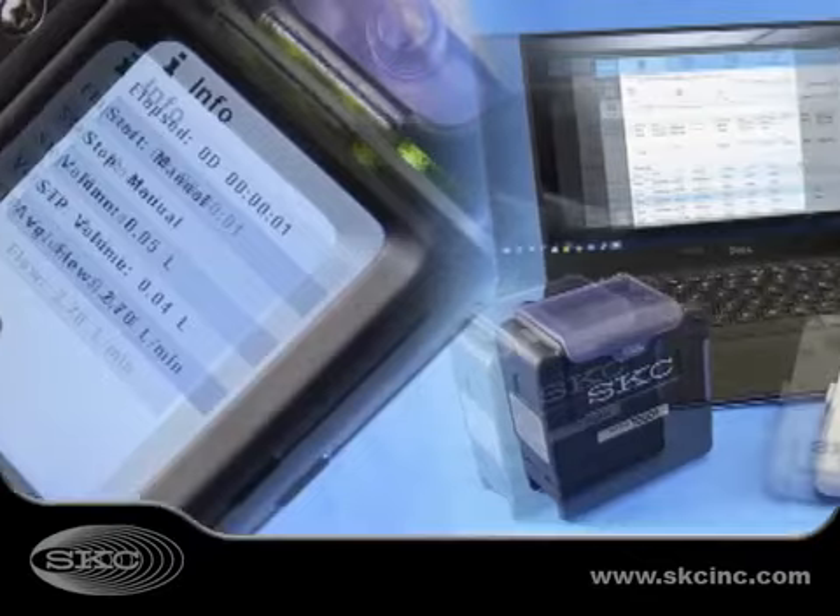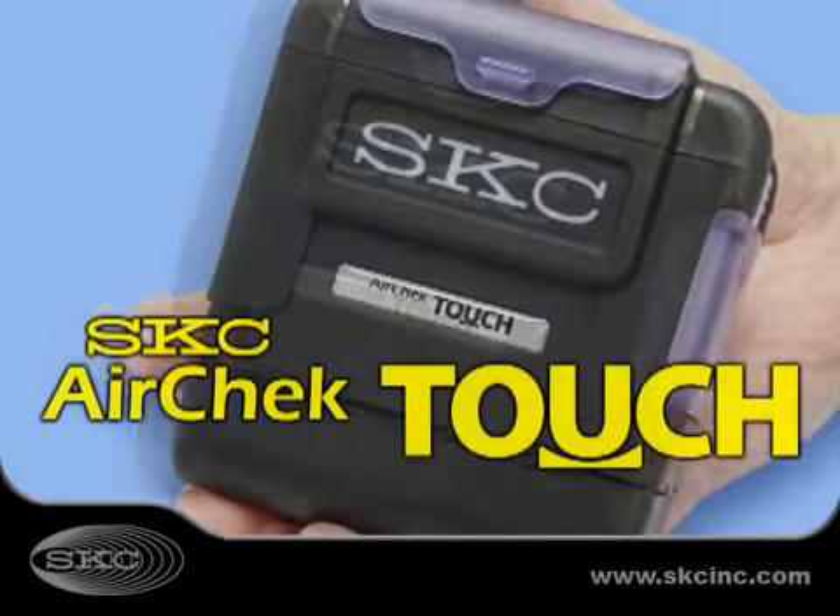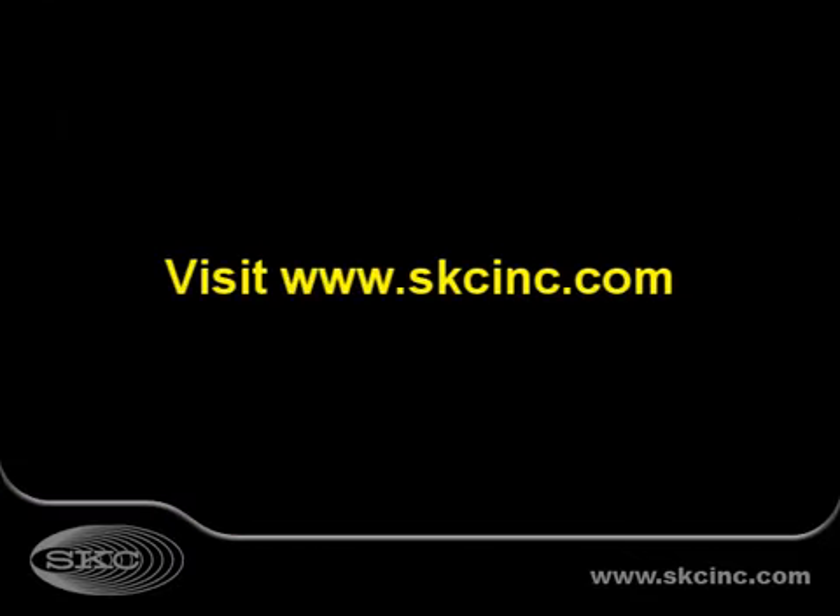The SKC AirCheck Touch sample pump. Learn more today at www.skcinc.com.